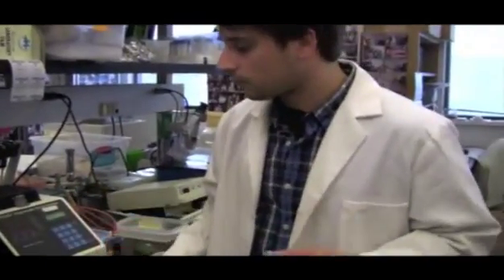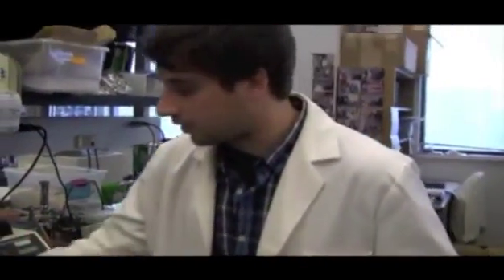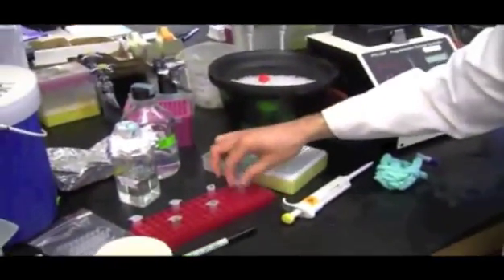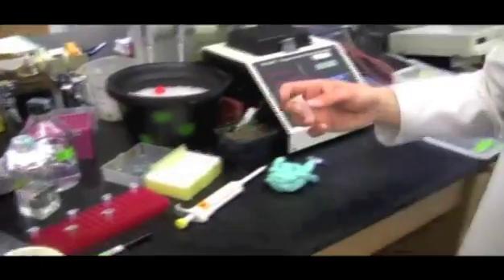And so what we're going to do is add the DNA that will tell the cell to add one of those glowing molecules, like the kind that are in my lab coat, to our protein. That way, when we shine a UV light on our cell, we'll be able to see it within the cell. I've also conveniently already done that. Where did it go? This guy. Right here. Okay.